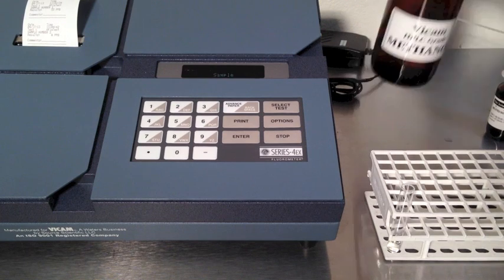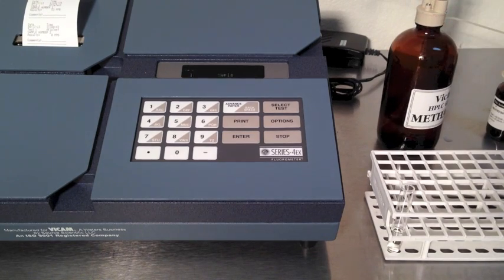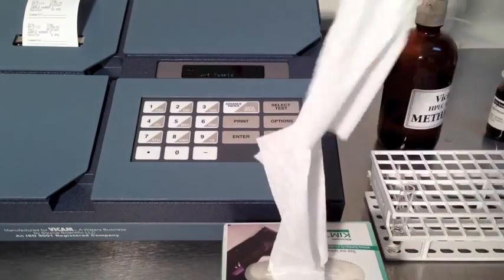Clean the cuvette with a wipe before inserting. Insert the sample and close the lid. In 60 seconds the display will show the results. Verify the result is zero. If not, use a new supply of methanol.